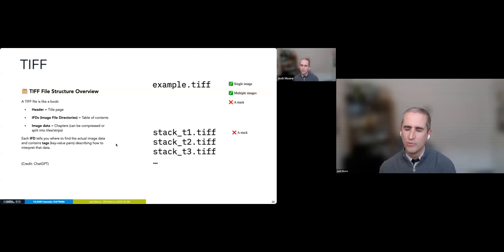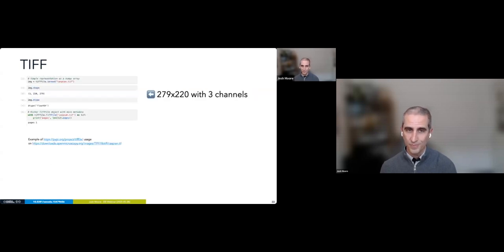And even if you have really good file names that everyone would understand, that doesn't turn it into a multidimensional image, right? So you've named your stack and you have a time point and you've put metadata into the file. That still doesn't make it a stack. Something else has to come along and turn this thing into a stack for you.